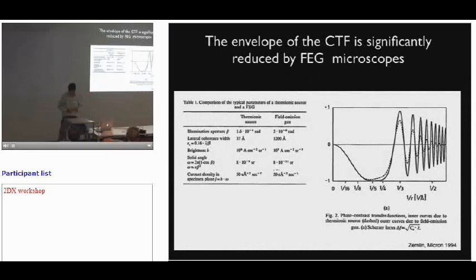There's one other property that's often mentioned in the context of the contrast transfer function, and this is the envelope, which is basically defined by the type of gun you're using. A lot of these advances that we saw in high-resolution structural determination were only possible with the introduction of field emission guns, largely because they are much more coherent. In principle, they are much brighter, 1,000 times brighter, and this way you can have a much higher coherence of your beam. This is one example comparing the envelope function with a thermionic source in the dashed case: at roughly 3 angstrom resolution we would have a dampening of 50% of our amplitude. In the case of field emission guns, it's still up to 90% there. And then the further we move out, the less information transfer we have.